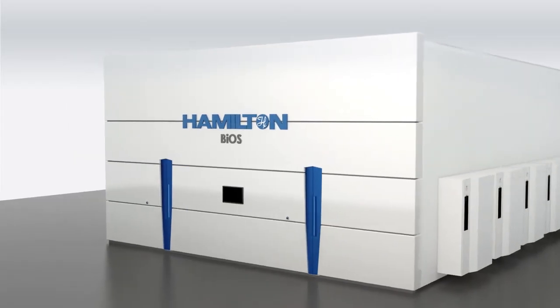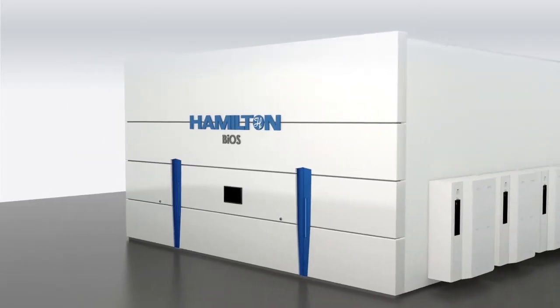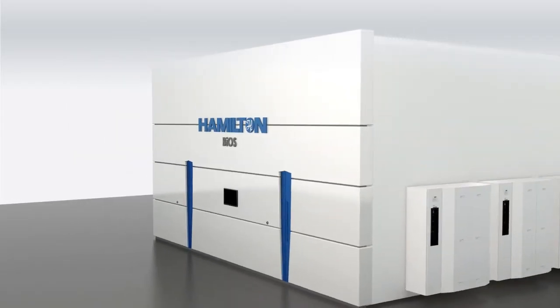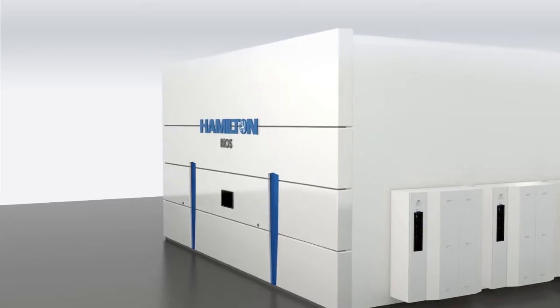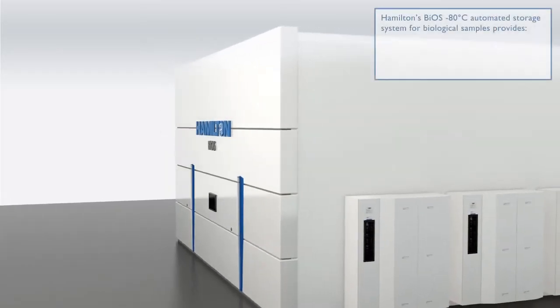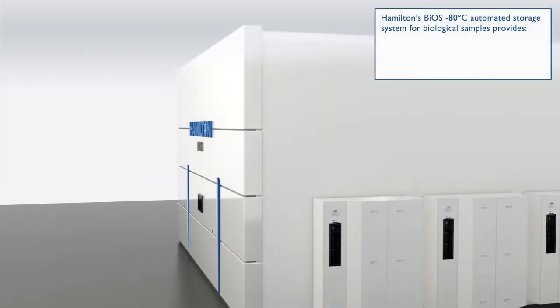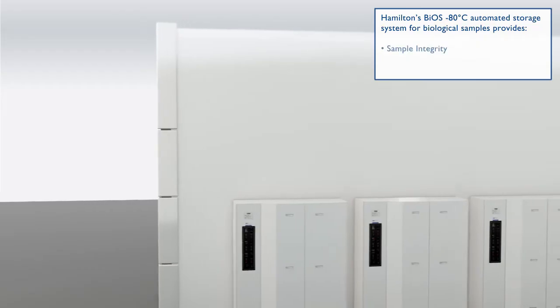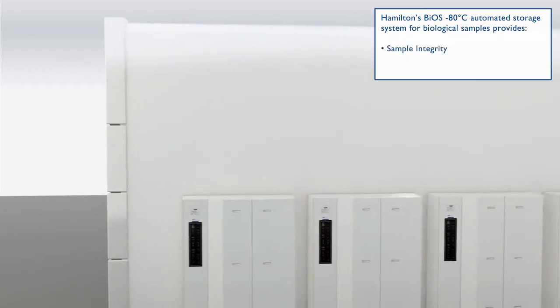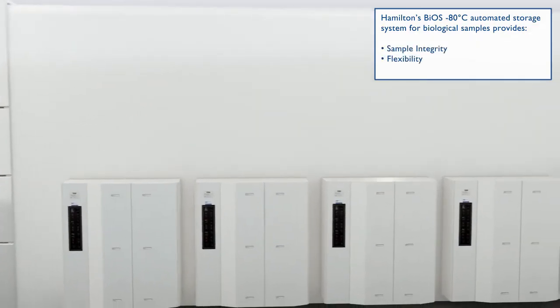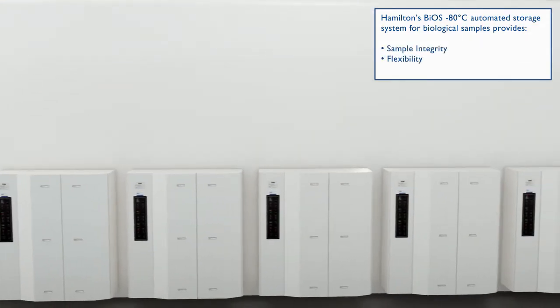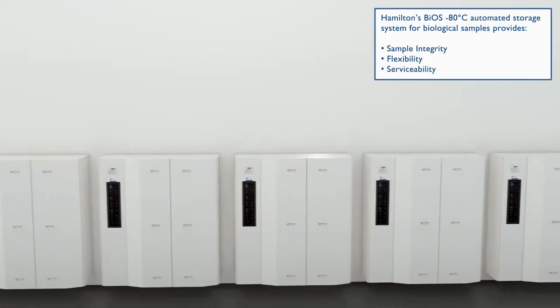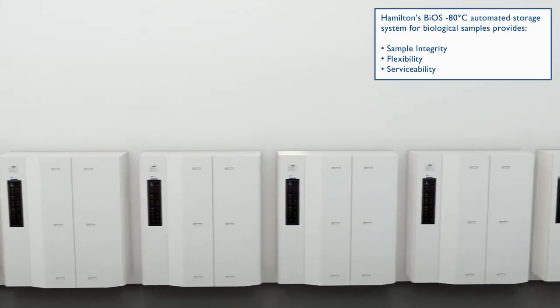BIOS is Hamilton's third-generation automated storage system specifically designed for storage of sensitive biological samples at temperatures down to negative 80 degrees Celsius. BIOS provides great solutions for the key challenges in automated ultra-low temperature storage.